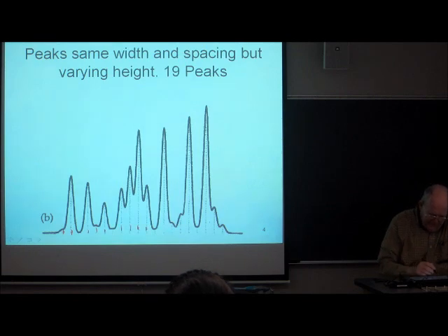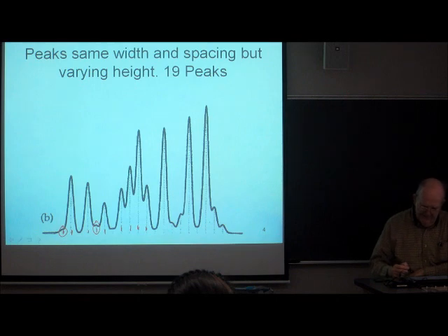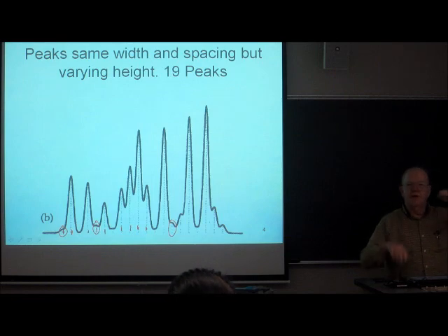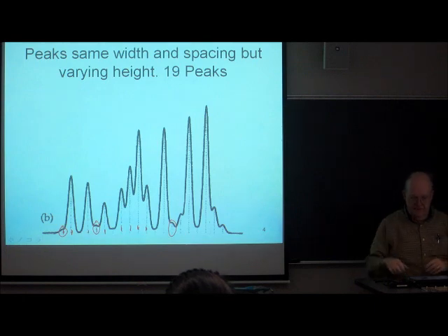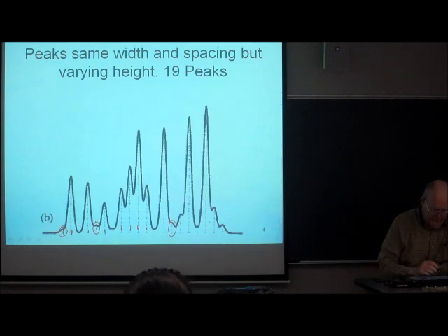And so on. But you can see here, we don't even really form a peak. And this is just barely a peak. And this shoulder is just barely a peak. You would say there's a peak there, but if the ratio of heights was a little bit worse, you wouldn't even see those peaks. So the relative heights of the peak can have an impact on whether or not you see a peak, because the resolution may not be good enough to see a minimum between the two maxima.